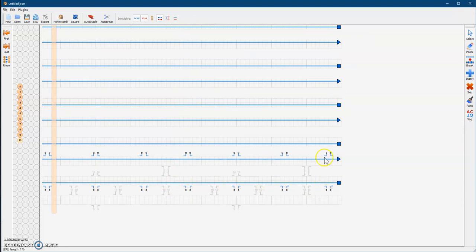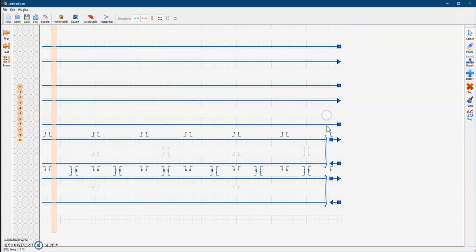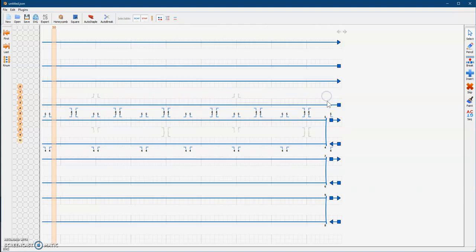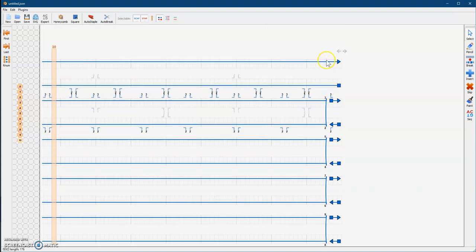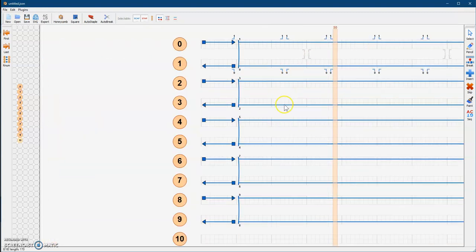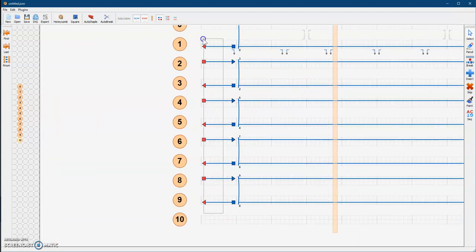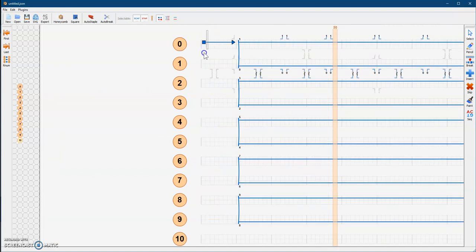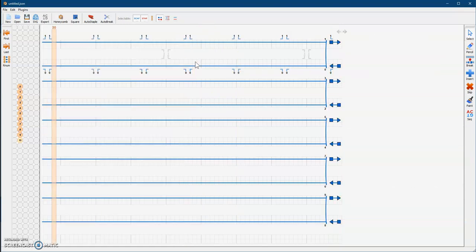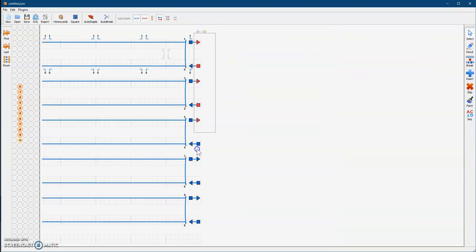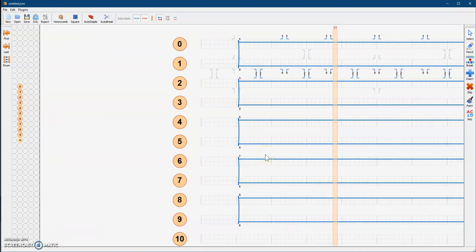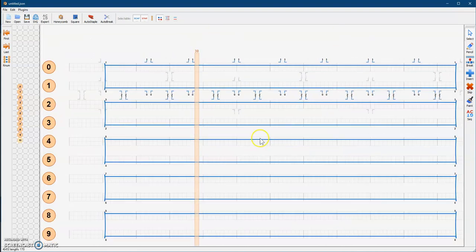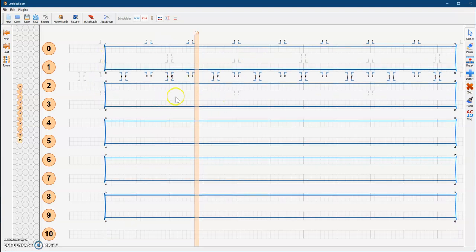Now we're going to go to the other side and do the same thing — connect these over here. Now we have all this extra stuff that we can select and then delete. I'm just highlighting them, selecting them, and deleting them with my keyboard. So now we have these two hooked up and these two hooked up, but they still don't make a continuous loop between each other — they all have different continuous loops but don't connect with each other.